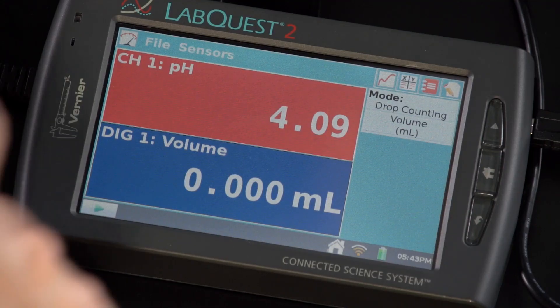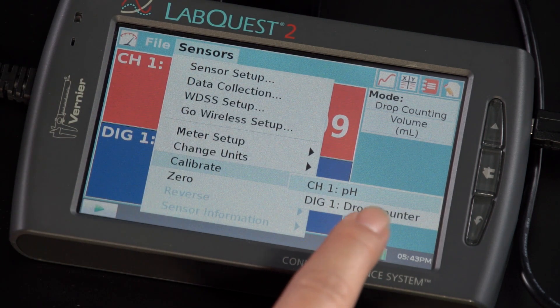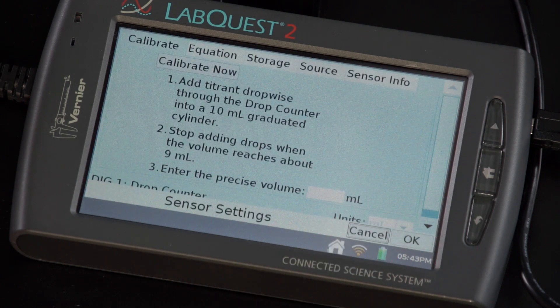If you want to calibrate in LabQuest, tap on Sensors, choose Calibrate, and choose Drop Counter.